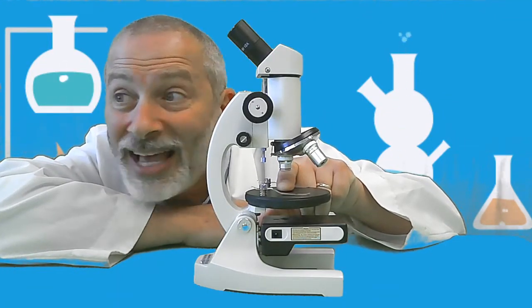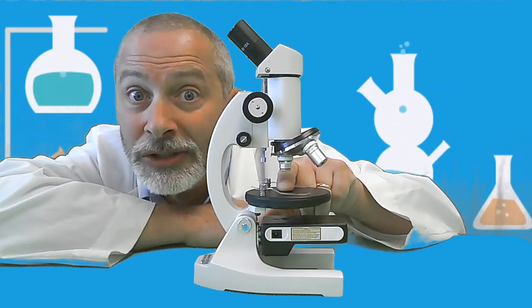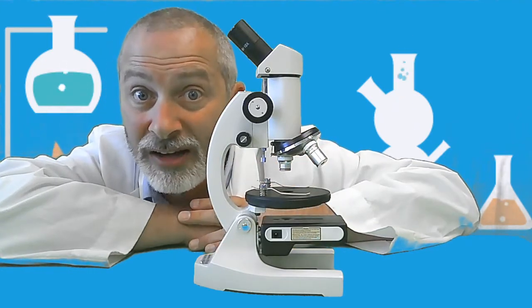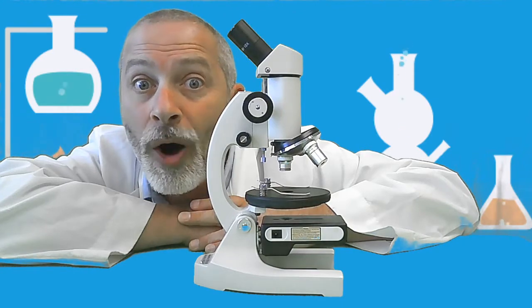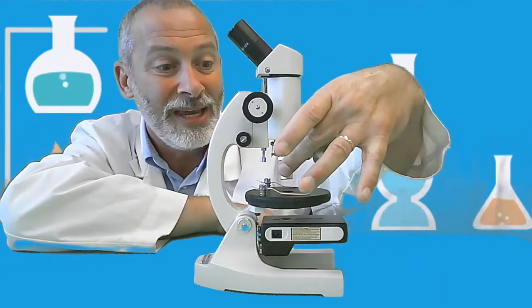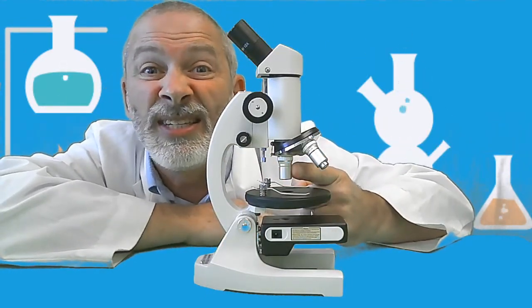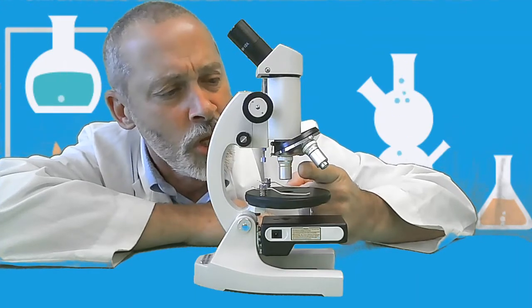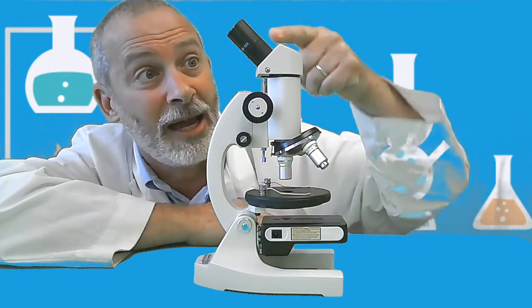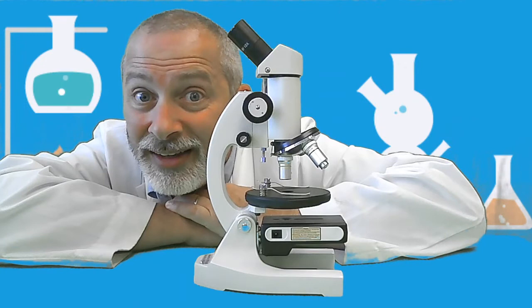Think about that. That's pretty tall. That's bigger than King Kong. 200 feet tall you would be at 40 times magnification power. Wow. But that's the low power. Let's move over to the medium power. The medium power objective lens is 10 times. So if you were to multiply 10 times 10, what's 10 times 10?